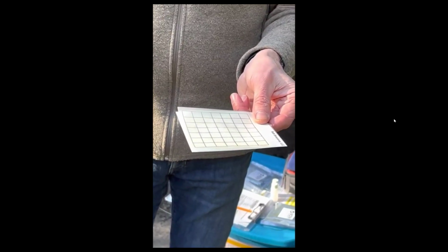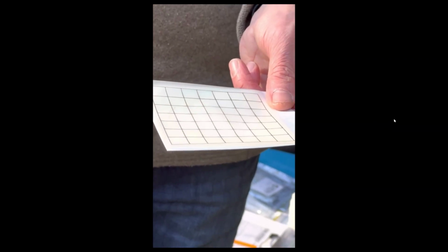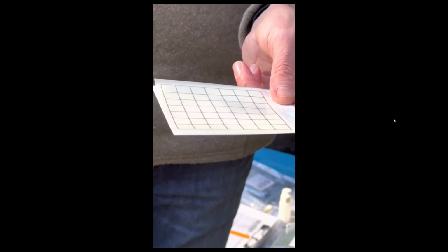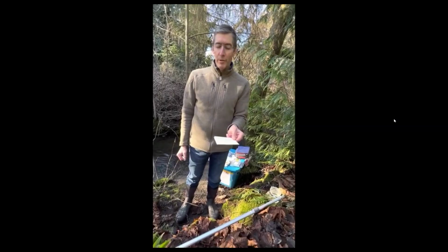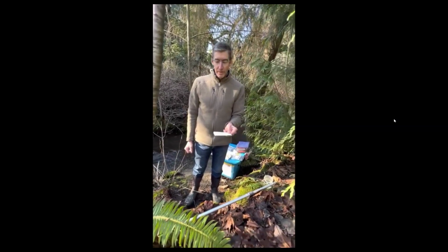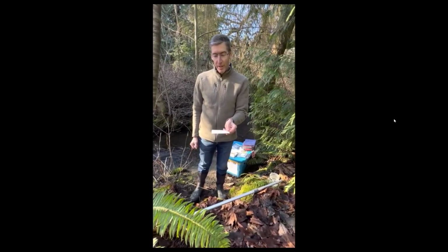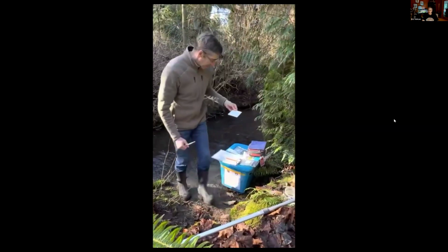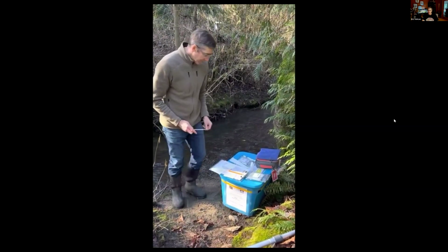The other issue that people encounter sometimes when they're collecting on our card is that if you tip your card sideways at this point, some of your sample can run off. And so at that point, you just have to repeat your sample. So the key is whether you hold it, or some people put it on a clipboard and hold the clipboard level, or you might have a partner help you hold it. You just want to let it sit level until maybe 30 seconds to a minute have passed. And then essentially it's spread out as far as it's going to spread out. So you can just set it on a level surface, and you're ready to collect your next sample.